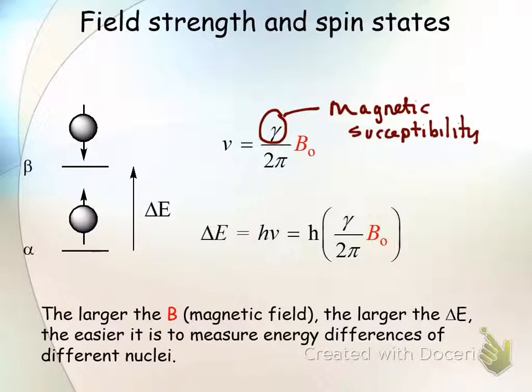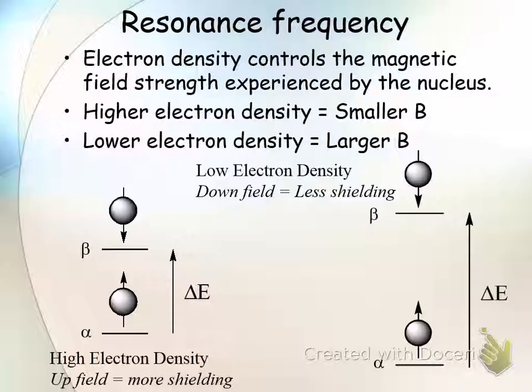When we do hydrogen NMR, you can deal with solutions that are about 5% product, which means a couple of drops in a couple of mils, right? Or 4 drops in a couple of mils. When you do carbon, it almost has to always be higher than about 80% to get usable data. So it's like 20 drops of your product, 2 drops of solvent. Why add the solvent at that point? Okay.